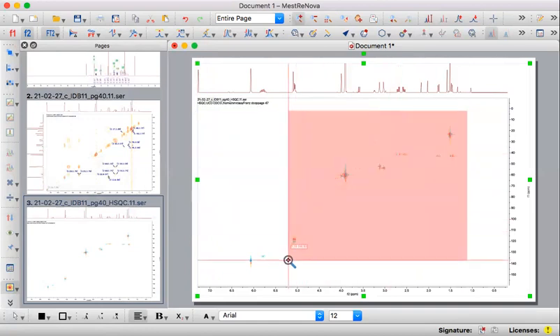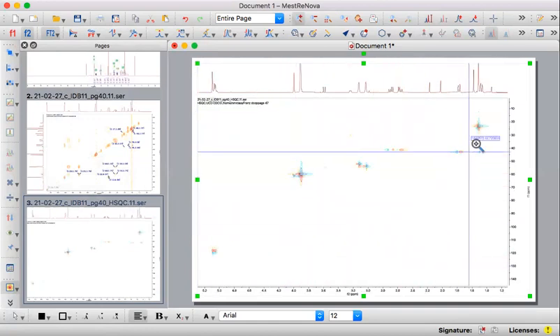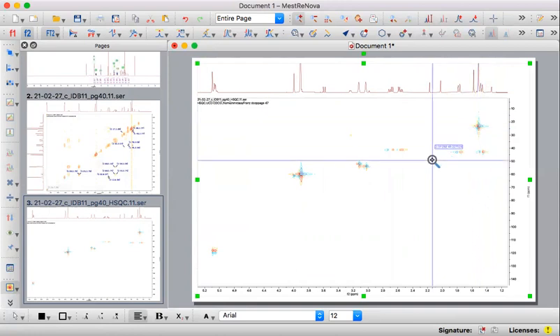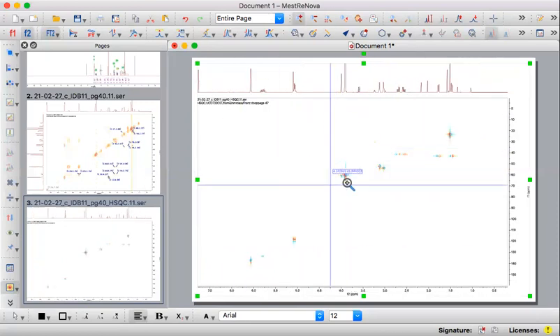So when you first load in your HSQC, it's going to look like these star patterns, these crosses, and we need to properly phase adjust it to get rid of that so we can get everything in just one spot where it's not smudged out as much. And you're going to want to zoom out so you can see the entire spectra.